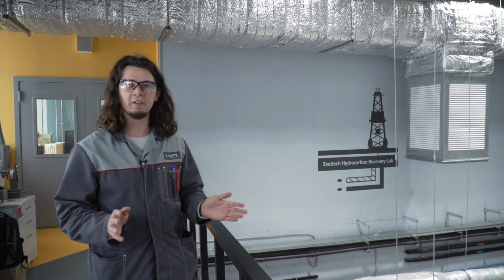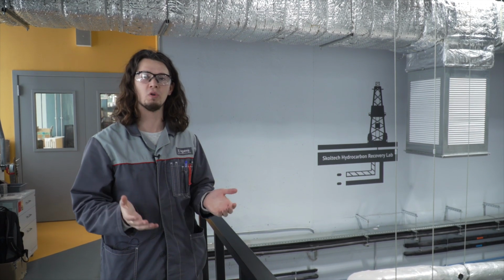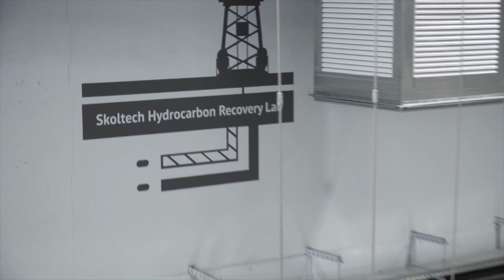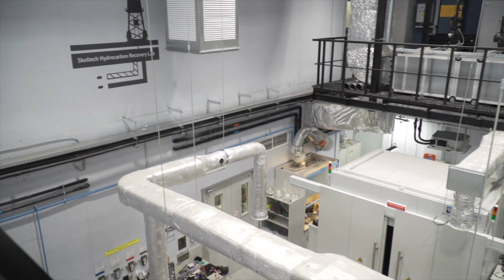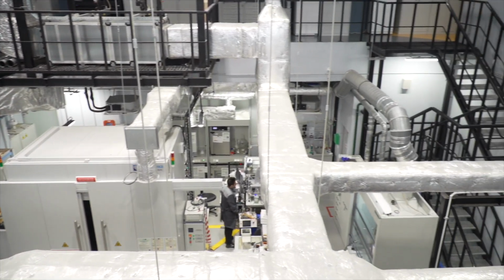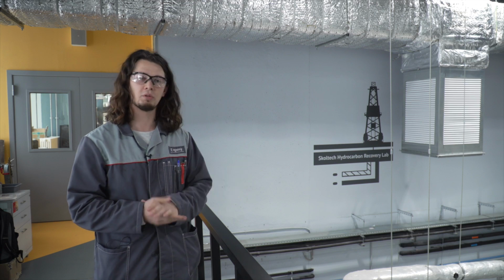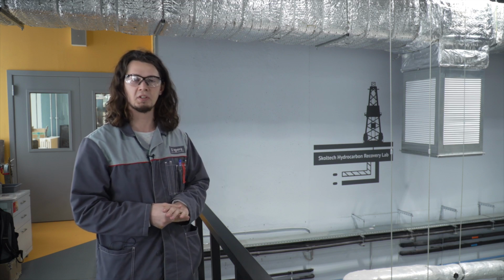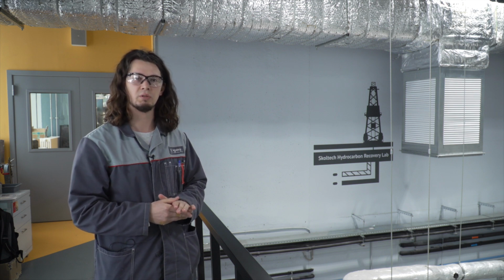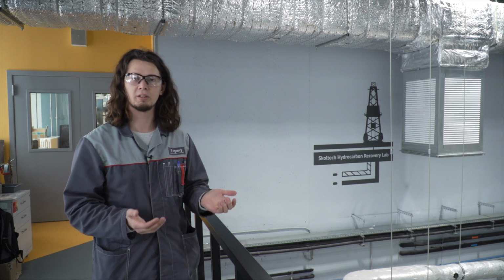This was a very short tour around our laboratory, and we have much more equipment, people, and different teams. You're going to be able to do really amazing and unique stuff here, which you won't be able to do in any other laboratory in other Russian universities and places. So just come to Skoltech, come to the professors, researchers, and feel free to discuss anything you want. You're always welcome, and we're going to be glad to see you here.